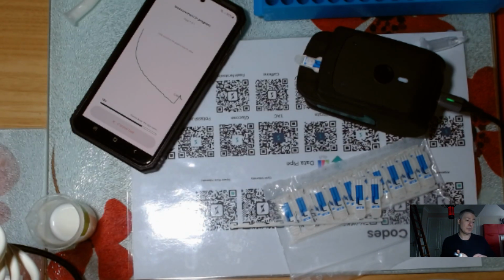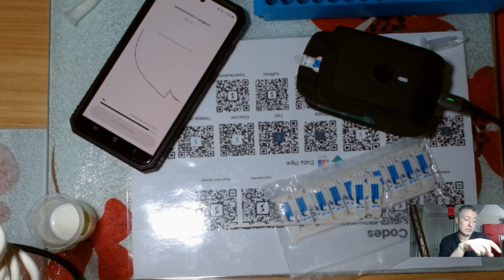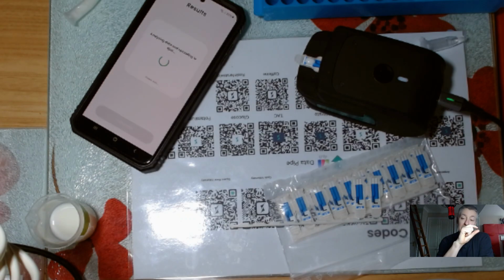And you can see that jump up like that. That's because I've just made sure that the PAA has actually got throughout the entire milk. When it comes to the end, you can see my signal before the PAA and my signal after the PAA. It's about 20 ppm in there. It's quite an intense signal. The reason I did it at 20 ppm is because people are kind of interested in that range of 0 to 2,000 ppm, so I essentially did it near the lower end of the range.